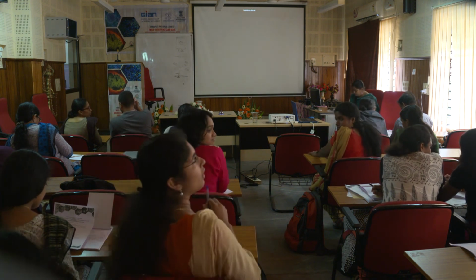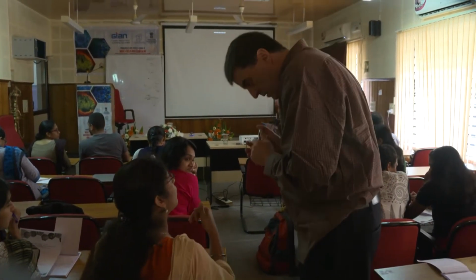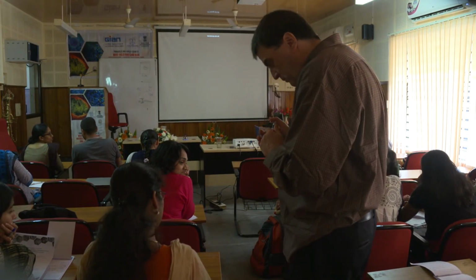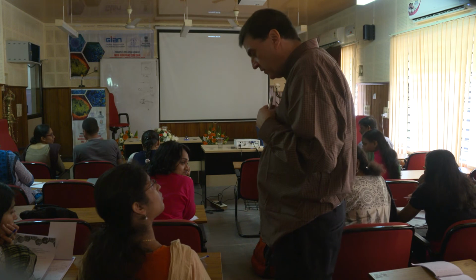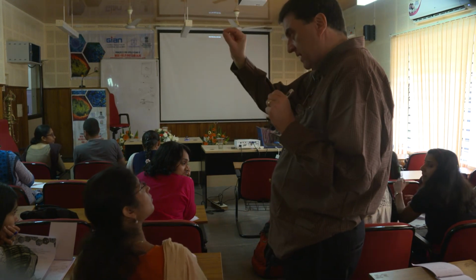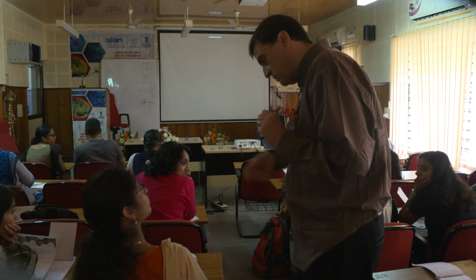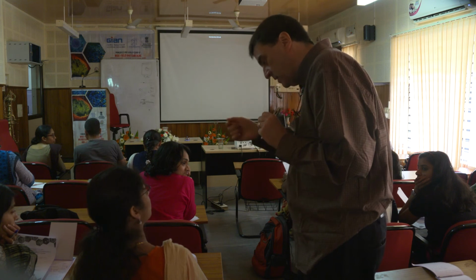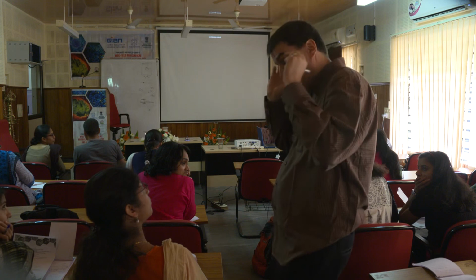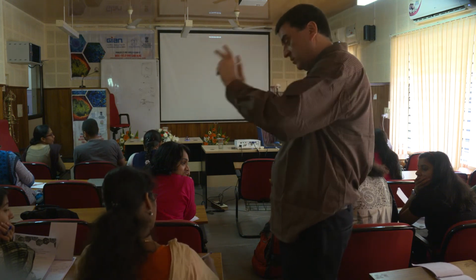Yes. In a spinning disk, how does the disk make the movement of light faster? Oh, the spinning disc? Yeah. On the laser scanning, you're taking the pinhole and moving it across the image like this. It's sort of slow, like a vacuum cleaning the room. Whereas the spinning disc lets you put the pinhole on the whole image, so you take the whole image at once. You don't have to go back and forth. It just goes, take the whole picture, take the whole picture.